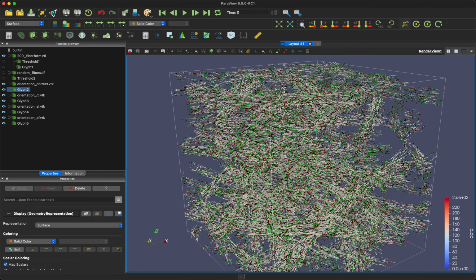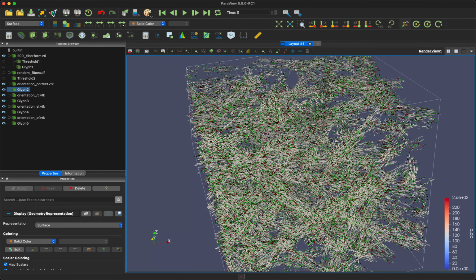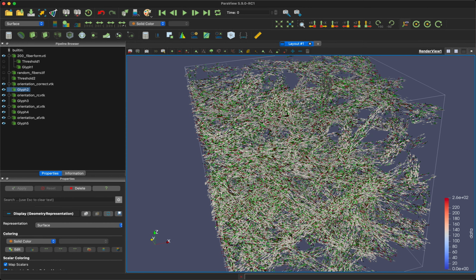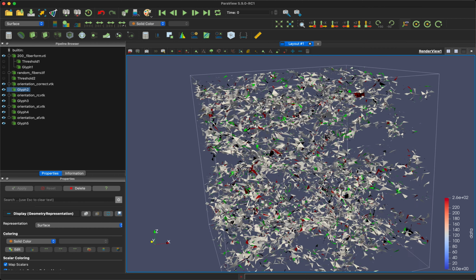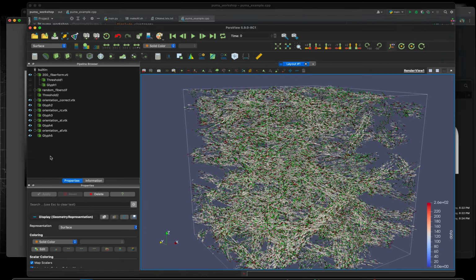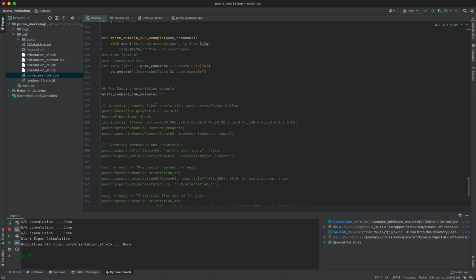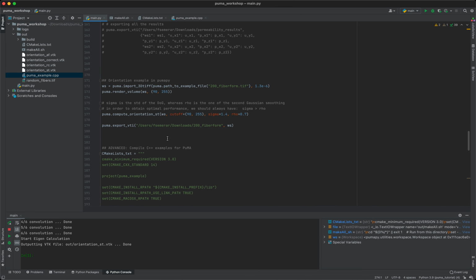Something else that we also analyzed, since this is not really decipherable visually, is that we also came up with a function for comparing the different orientation fields that have been computed. I would recommend to start with the structured tensor in Python. That's the easiest thing to run and the most user-friendly. If you need more advanced capabilities, I would then jump inside the C++.